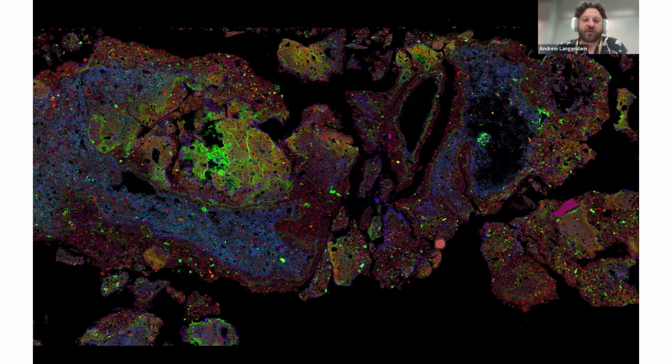You can see that the copper and the zinc are being mobilized very differently. You've got a lot of copper being accumulated here in these areas. Zinc is being slowly mobilized throughout the sample, even though normally it's a much more mobile element. Iron is seemingly unaffected. And it's gotten to the point where you've got this structure here, which almost looks like a little bit of a snail, which I like.